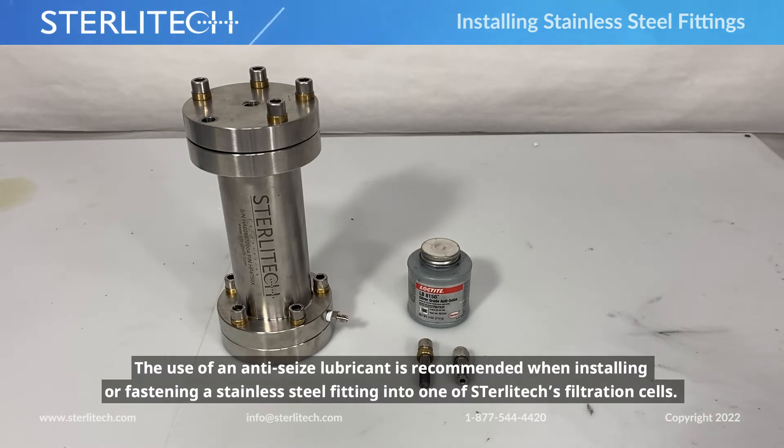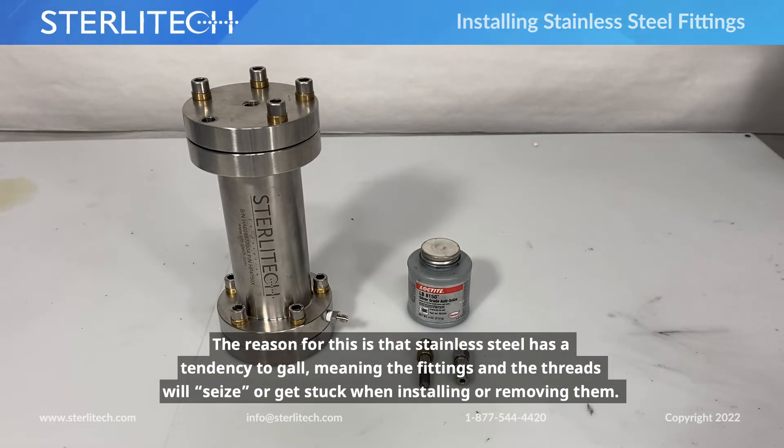We recommend the use of anti-seize whenever you're installing a stainless steel fitting or fastener into one of our cells. The reason for this is stainless steel has a tendency to gall, meaning the fittings and threads will seize or get stuck when you're installing or removing them.